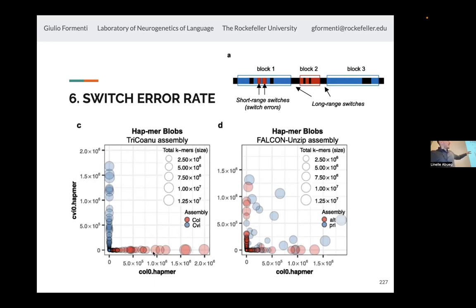On the left, there's an assembler that can take advantage of the parental information. So you provide short Illumina reads to the assembler, and basically, you can completely separate the 2 haplotypes. You can see that there are no bubbles that have a mixture of X and Y, a mixture of paternal and maternal haplotypes. Whereas when you don't provide that kind of information, you start to mix them.